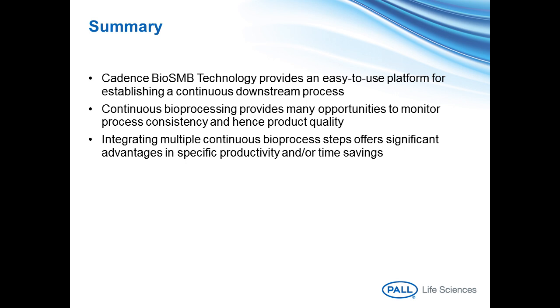Well, the principal components analysis is actually a statistical approach to look at the raw data. So we do not manipulate the raw data. We've collected the data, and then we're going to look within that raw data for the largest source of variation. People are normally inclined to look at similarities. If I look at my left hand and my right hand, I find them quite similar, even though there are obvious differences. These differences are very easily detected by principal components simply because it projects that data set and finds an axis, or a hypothetical axis, that displays the largest source of variation. And the projection of the data on that axis is going to be my first principal component.